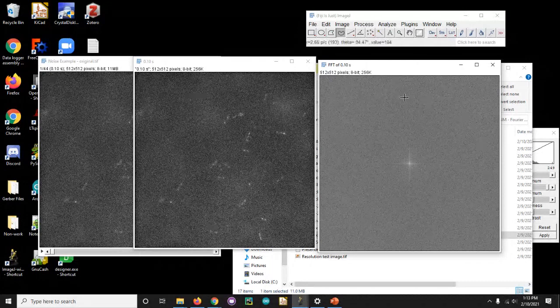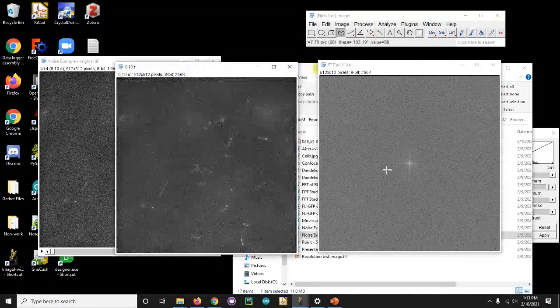You have to sum all these back together to figure out what the true intensity is at that point. So that's the beauty of doing this Fourier transform processing: if you do things in the frequency space, it's always going to act uniformly on the entire image. So I can't look at this pixel and go, oh, that's this point on my image.